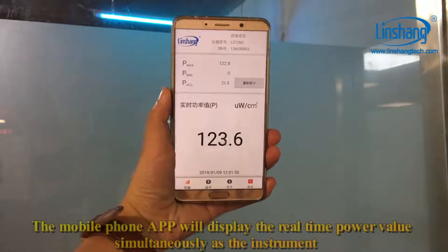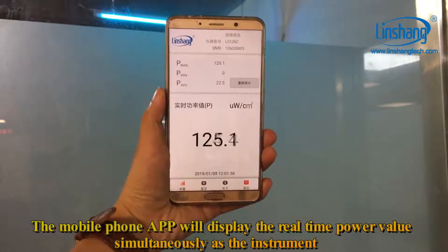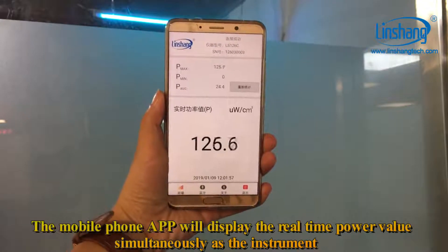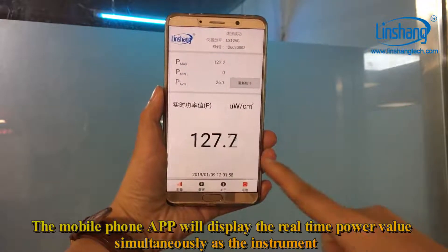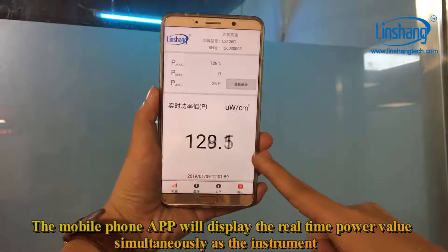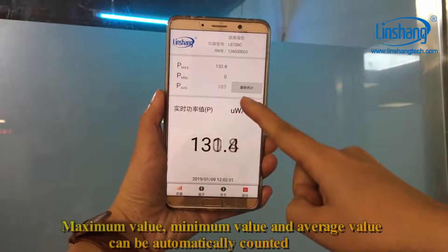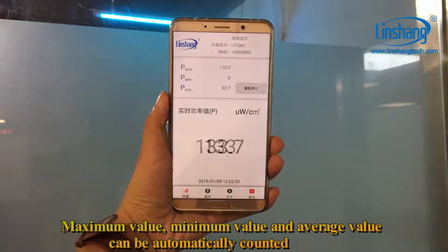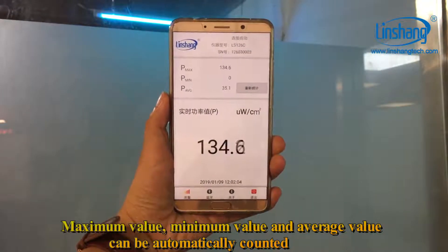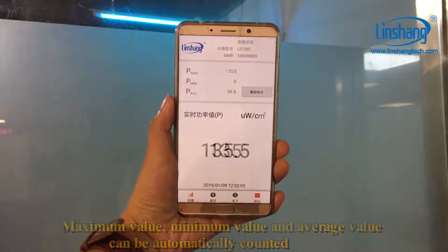The mobile phone app will display the real-time power value simultaneously with the instrument. Maximum value, minimum value, and average value can be automatically counted.